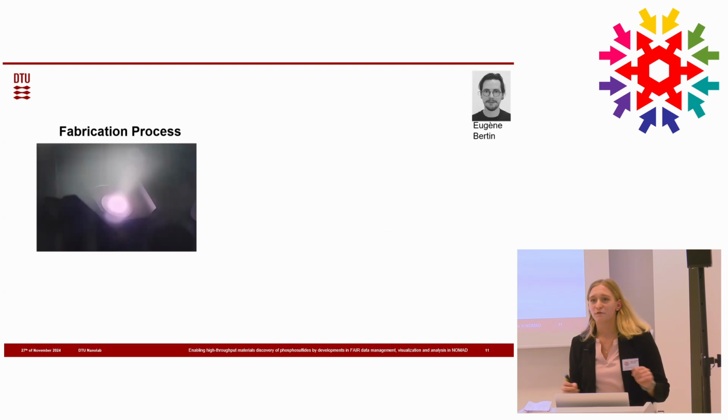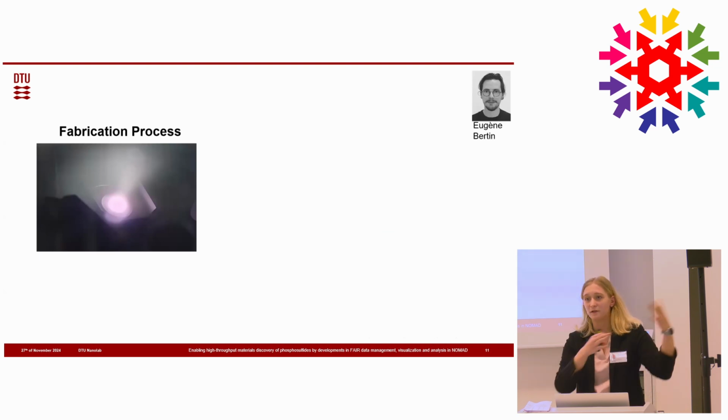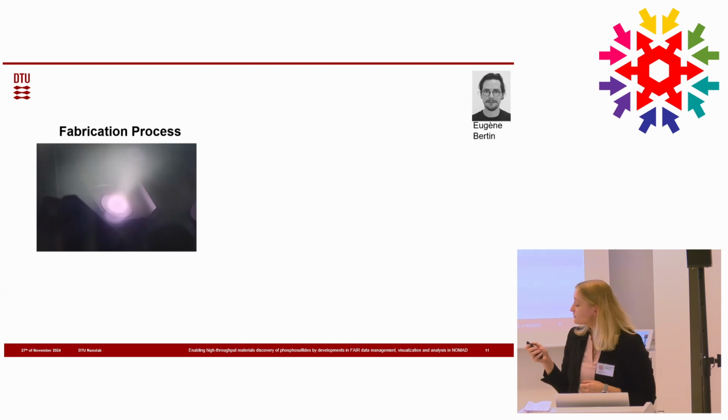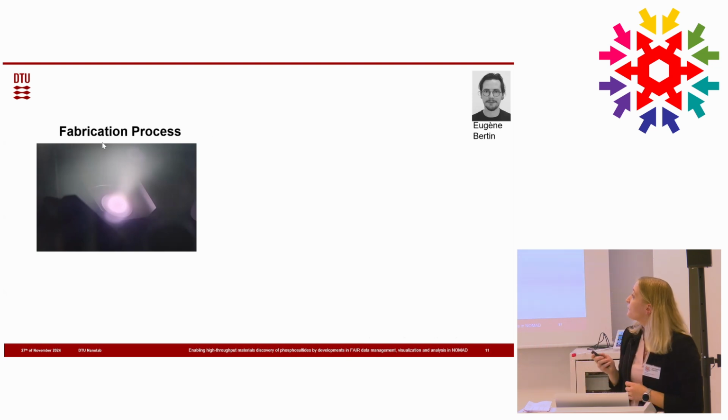Now finally, we can go to an experiment. We have our material, we have our substrates, we can start a deposition. This is roughly what it looks like. Plasma deposition, for those who have never seen it.